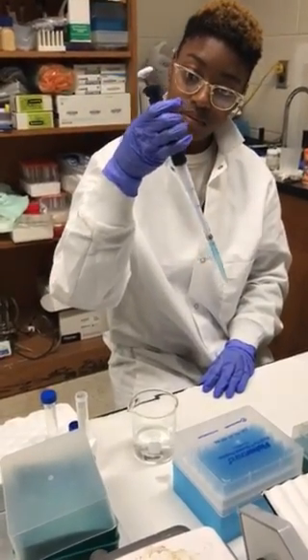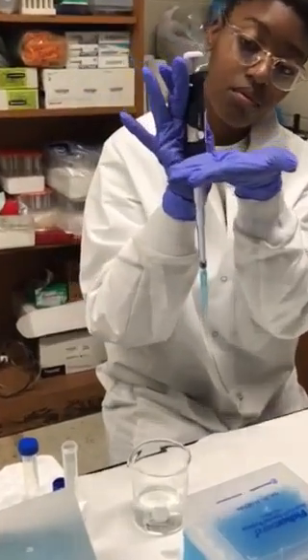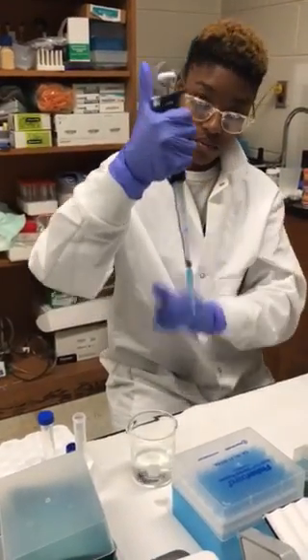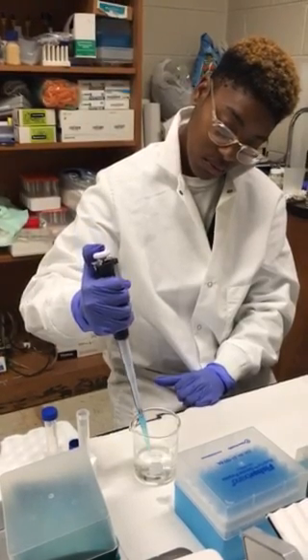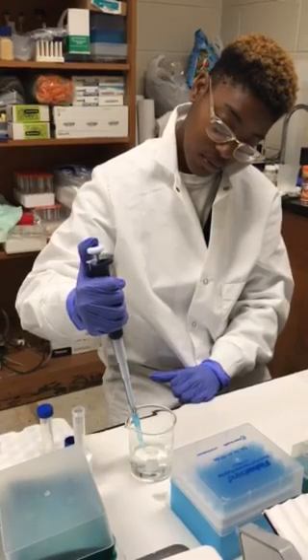Before collecting the solution, make sure the pipette is set to the desired volume. After the volume is set, it's time to collect. Press the plunger down to the first stop before putting the tip into the solution. After gathering the solution, release the plunger slowly from the first stop to prevent air bubbles.